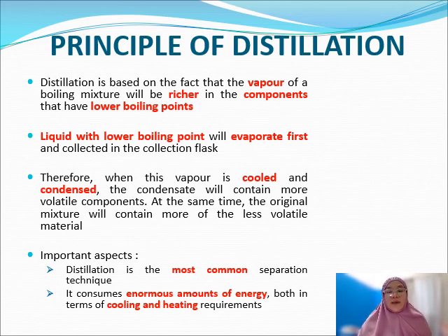An important aspect of distillation is that this is the most common separation technique. If you read any journal, distillation is a very common technique used to separate the compounds from solid or liquid into solvents. So this is the main principle of extraction being applied, the distillation process. However, this technique consumes a lot of energy because it involves cooling and heating.